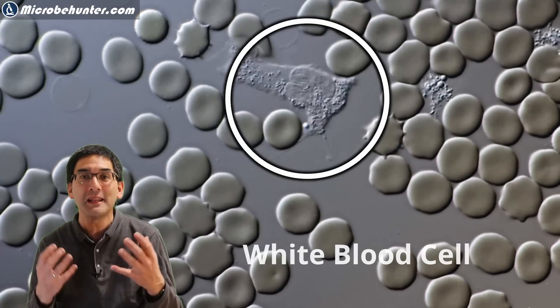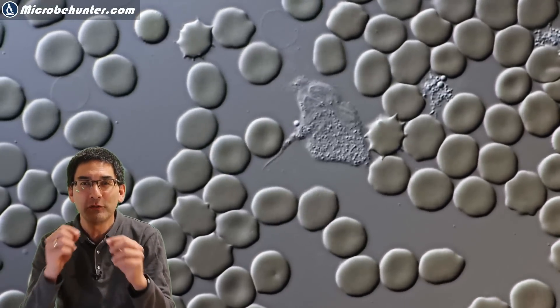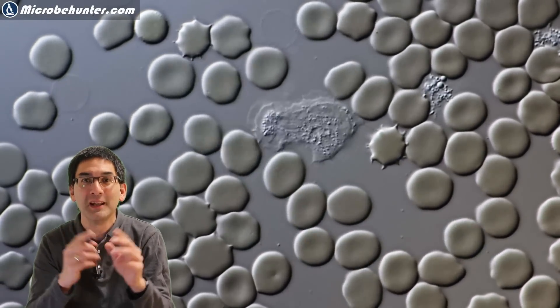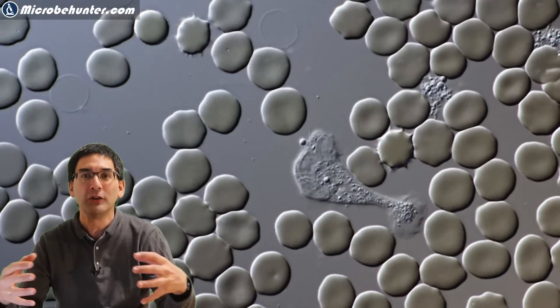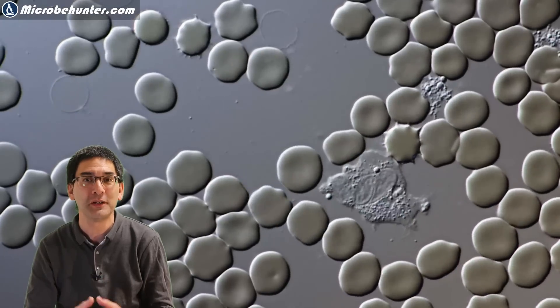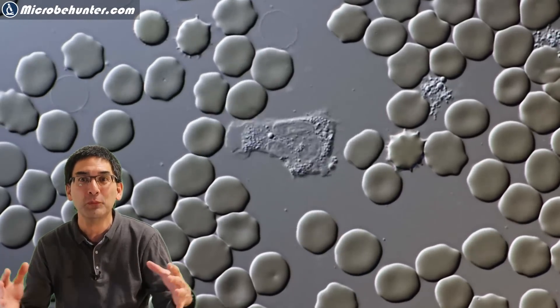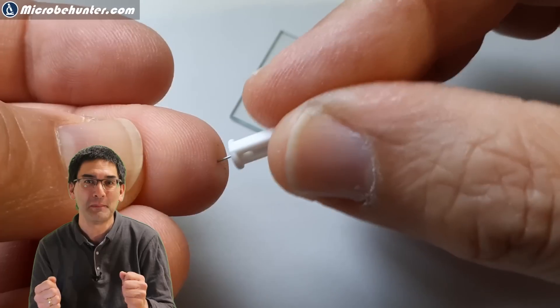When you've got a small wound and bacteria enter your body, those phagocytes are the first line of defense. They will engulf and eat up those bacteria a little bit like an amoeba, and indeed they move around in an amoeboid manner.